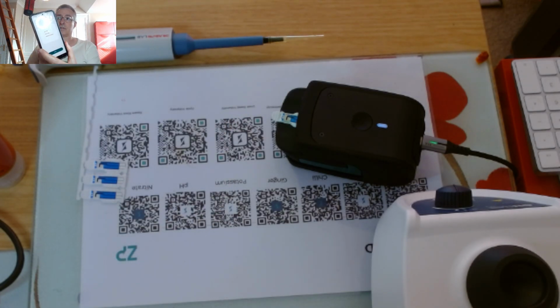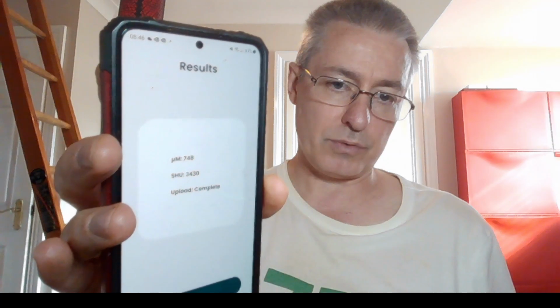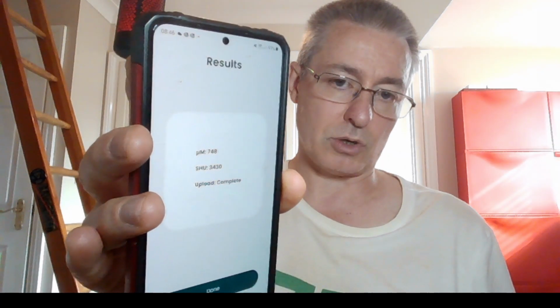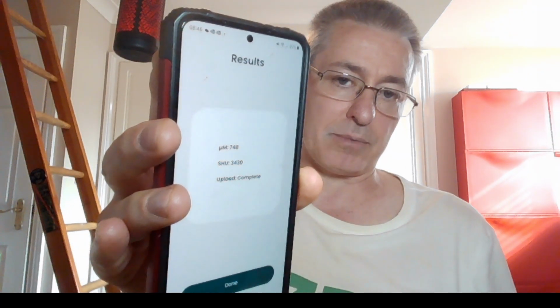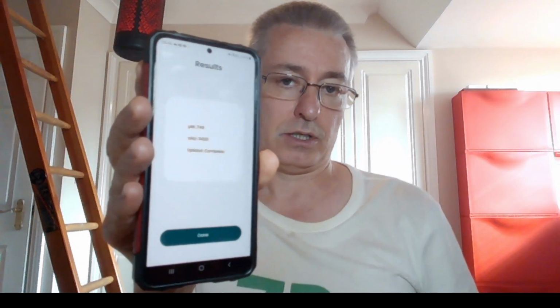Let me just change the camera to this one. So I've got a result on my phone. I've got a result of 3,430 Scoville heat units, and it also says that the upload is complete. What I was testing was Tabasco sauce, because it's so quick to make up a test on this. If you Google Tabasco sauce, you'll see that we've hit right in where they expect the result to be.